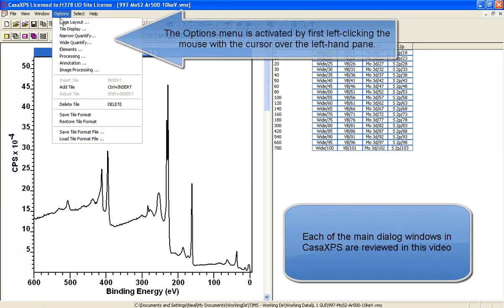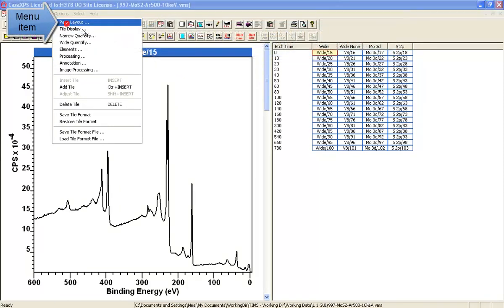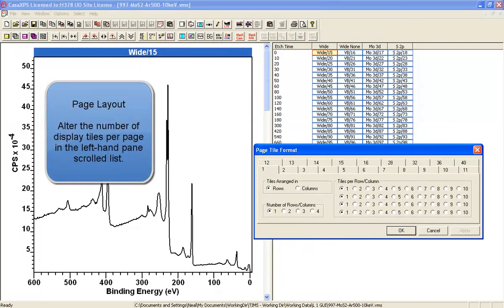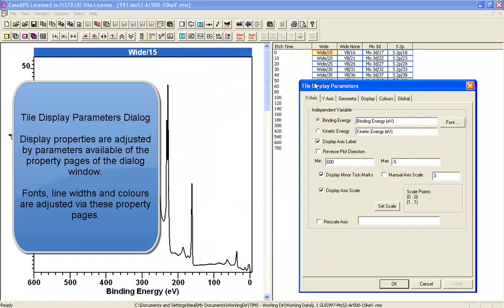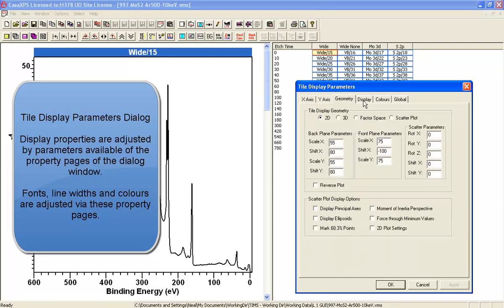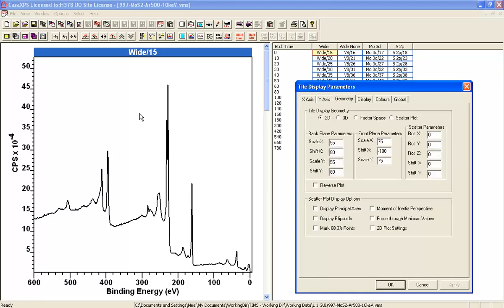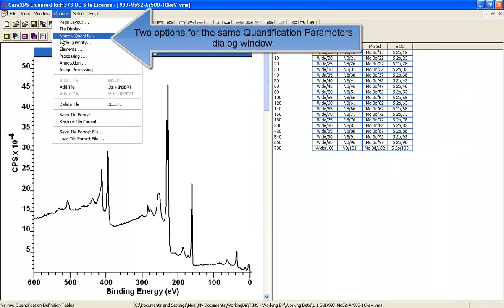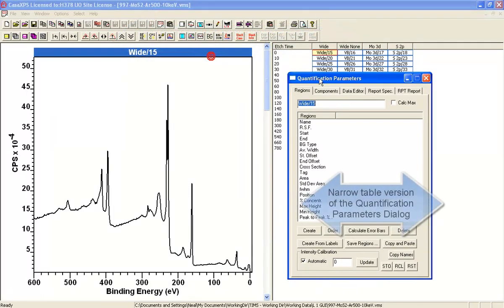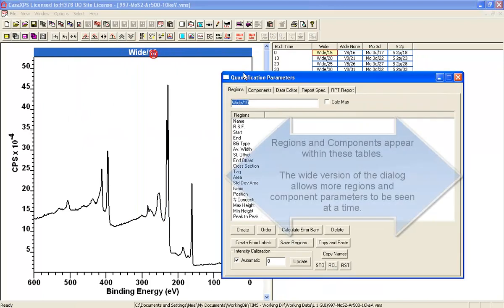The options menu provides access to a range of dialog windows. You have page layout that allows you to adjust the number of tiles per page in the left-hand side. You also have the display parameters, which are a range of property pages allowing you to adjust the display in the left-hand side. You also have the quantification parameters dialog window, which if you invoke from the wide option will give you a larger version of the window.